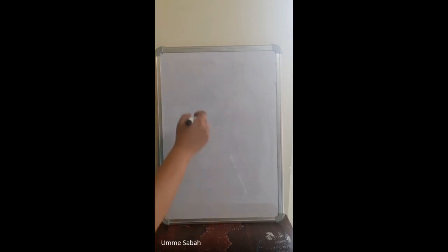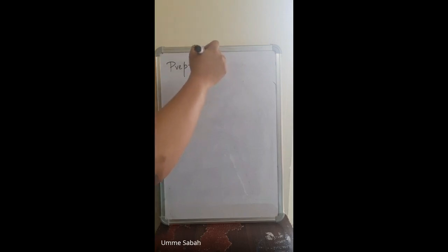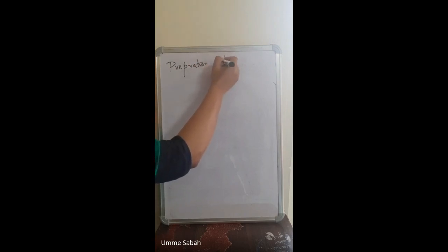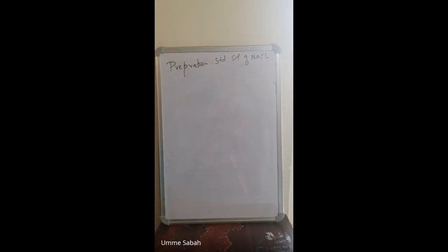Next. Now, here we are preparing sodium chloride. Preparation of sodium chloride. Here also, you have three parts for the procedure. First part is preparation of standard solution of sodium chloride.